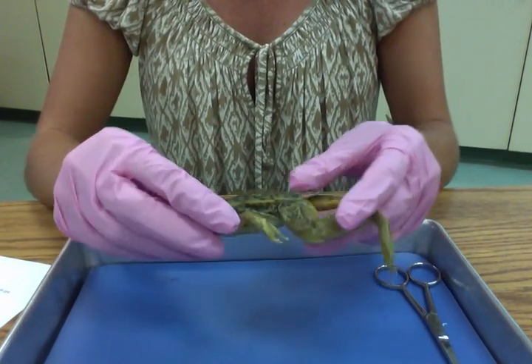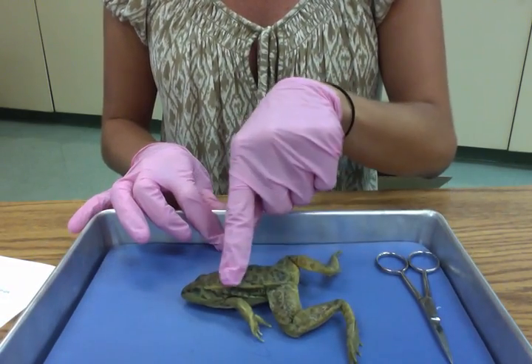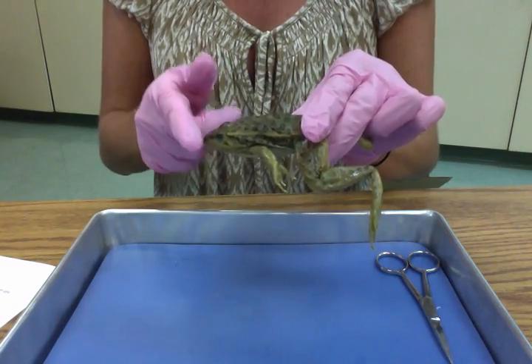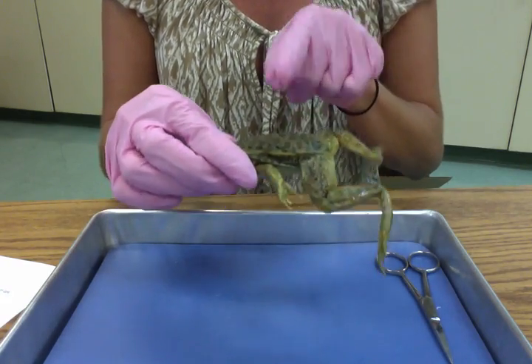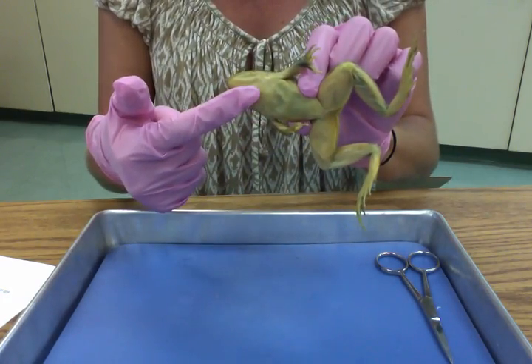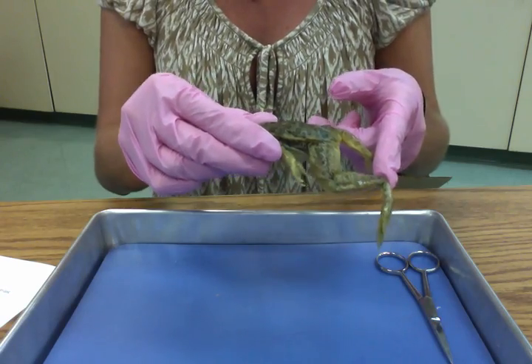Okay, we're going to begin by putting our frog dorsal side up. Dorsal is the back, so this is our dorsal side. This is our ventral side. When I talk about anterior, I mean towards the head, and posterior means towards the end of the body. So let's do a quick review. Dorsal, ventral, anterior, posterior.